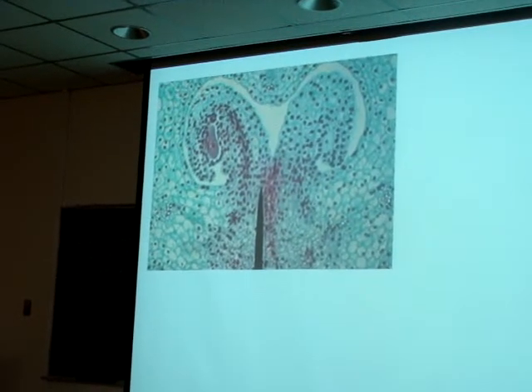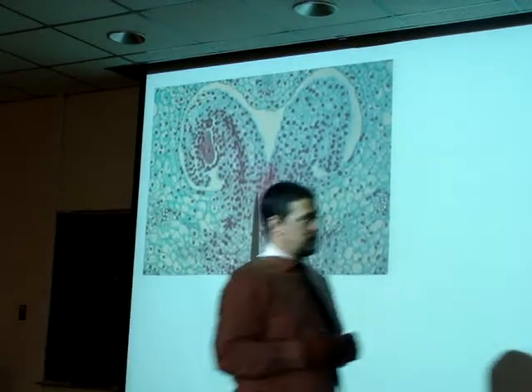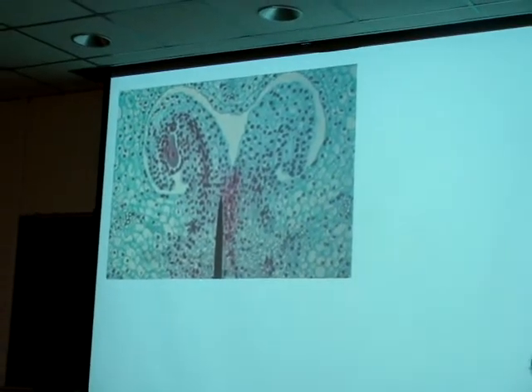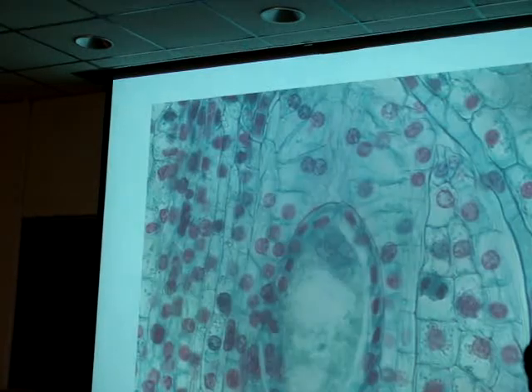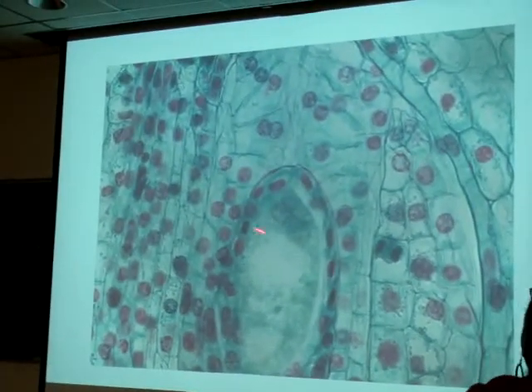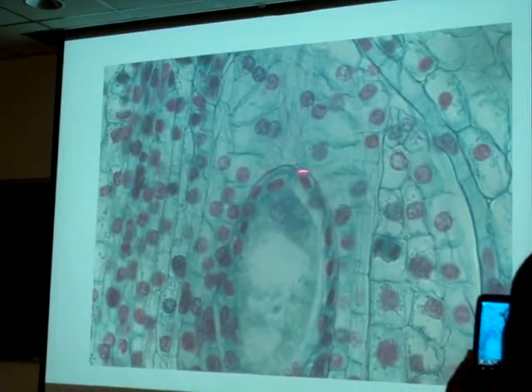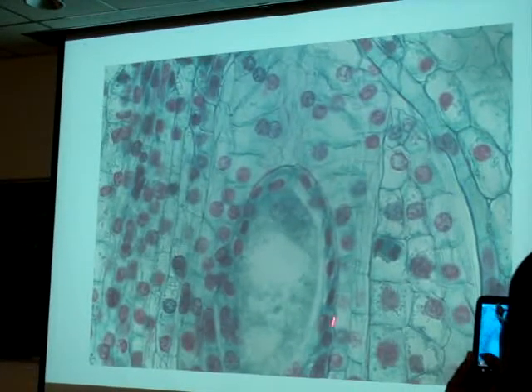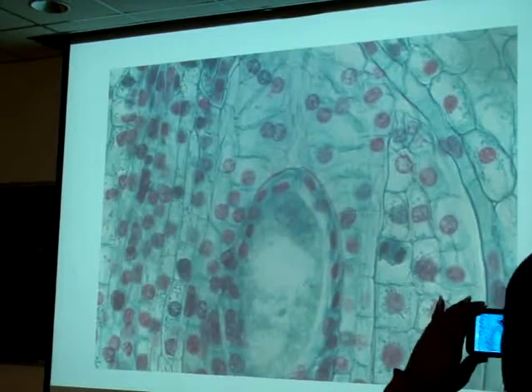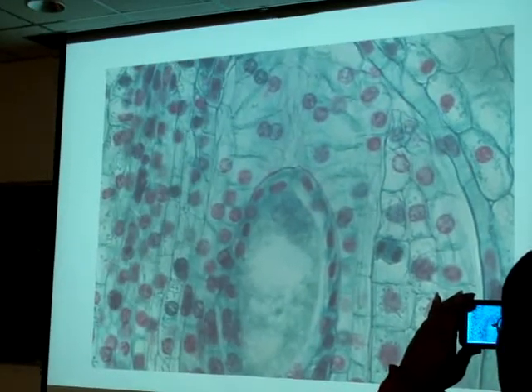You guys with me? Now you're real close. What is this? Egg apparatus. The layer of cells right on the edge makes this the nucellus edge. It might be the funiculus over there, but you can't really tell.